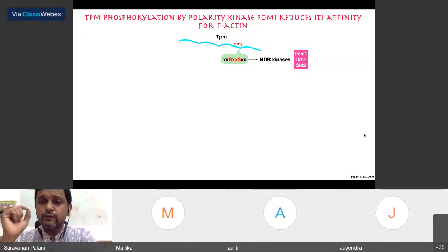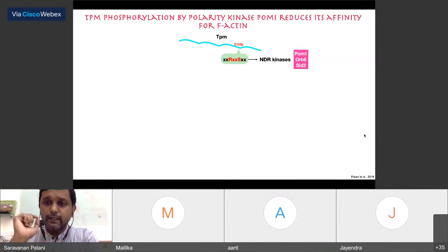You cannot tag them. So then we use a cysteine-based maleimide labeling, which many single molecule people at the minute are using, and it's very easy to use because there are commercial dyes. You have to introduce a cysteine far away from an endogenous disulfide bond, so that you do not interfere with it. So you can put a linker and have a cysteine, and then you can label them for visualizing. In that case, I have to do it for both tropomyosin as well as actin.